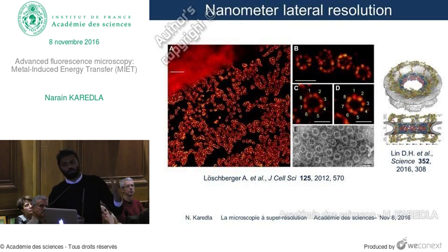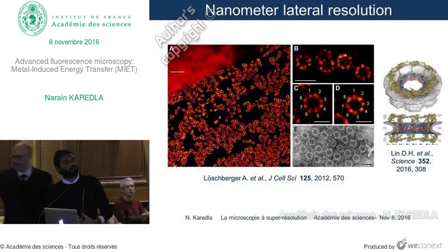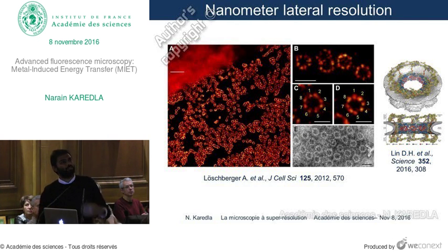For example, there's the nuclear pore complex, which we'll have in the next talk. The proteins are labeled here with fluorescent molecules, and if you resolve them with the STORM microscope, you can see the 8-fold symmetry of the arrangement of proteins in the outer ring.